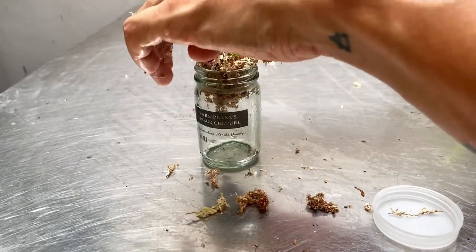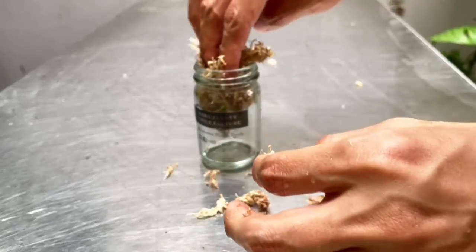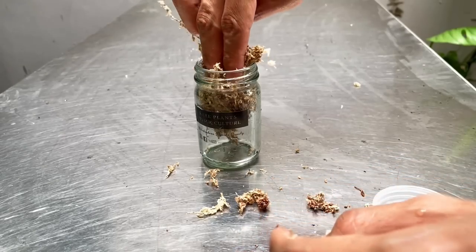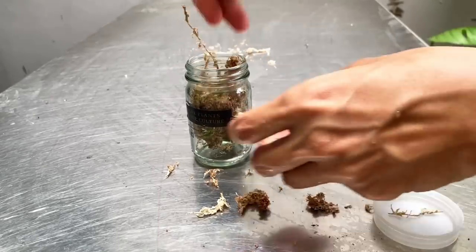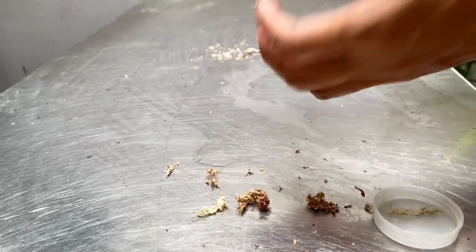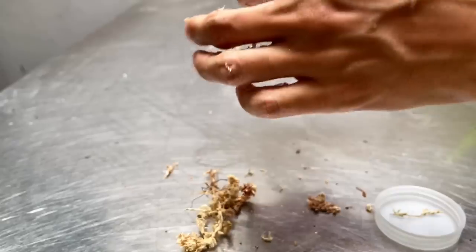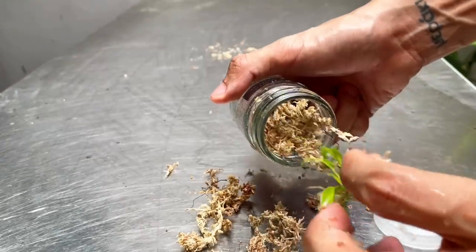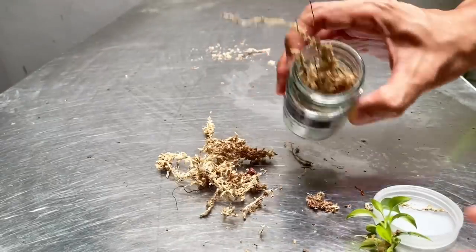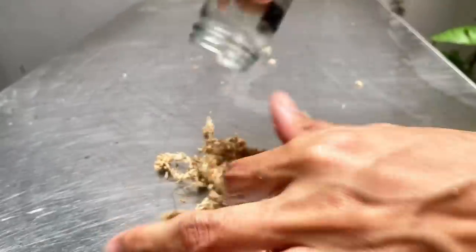I put it back in the bottle only because I wanted it to be used to the previous environment it was in before — the same kind of airflow. But this may not have been a good idea — now I can't get it out. Let me slowly get the moss out. That was actually a bad idea — the whole thing did not fit in here. So let me devise a new method.